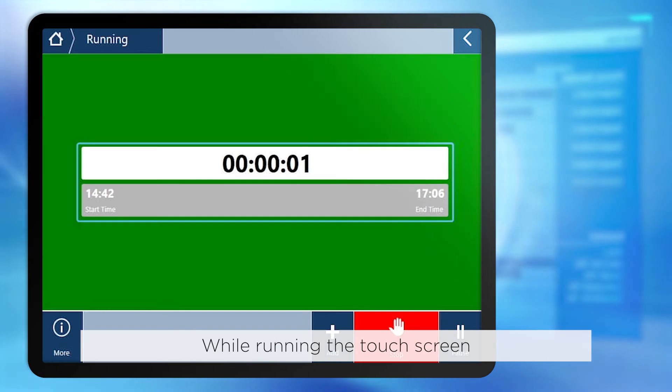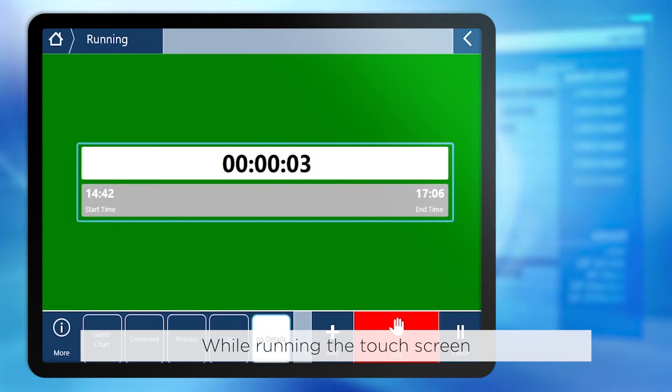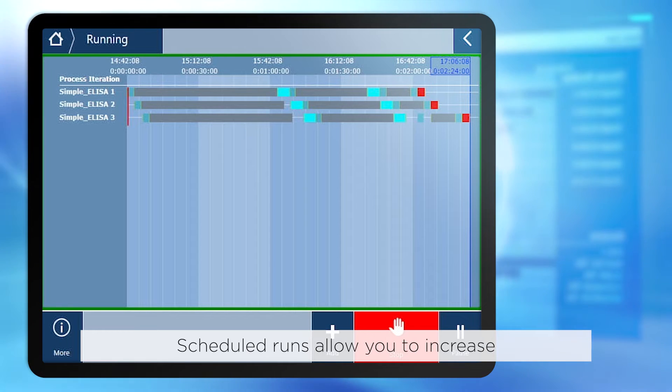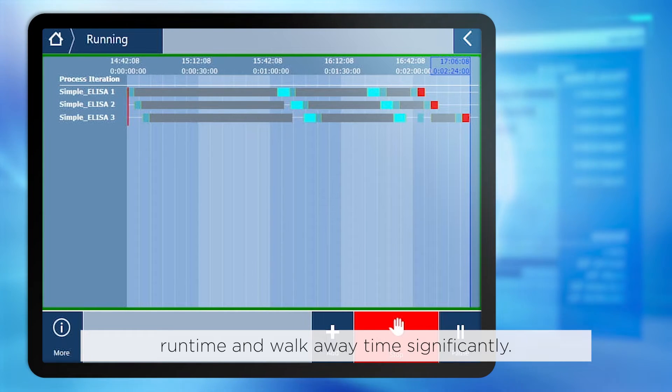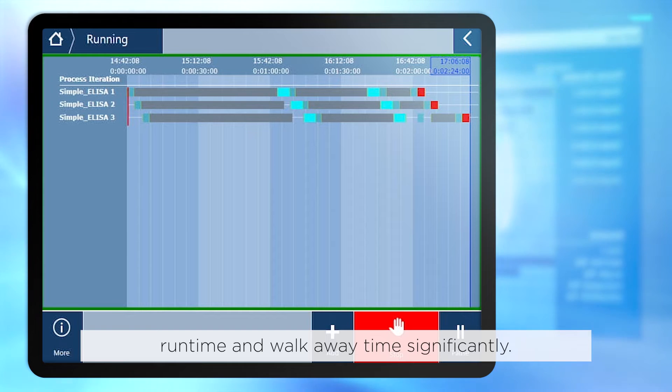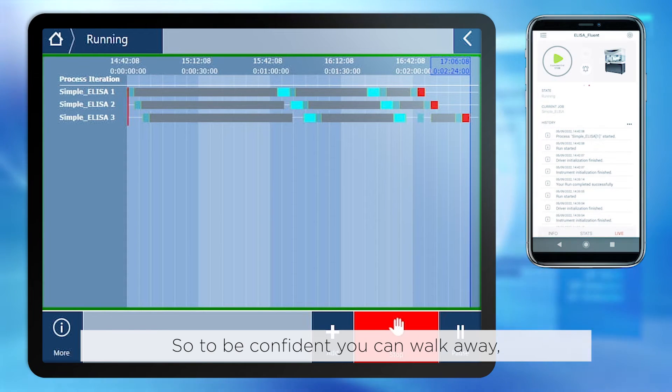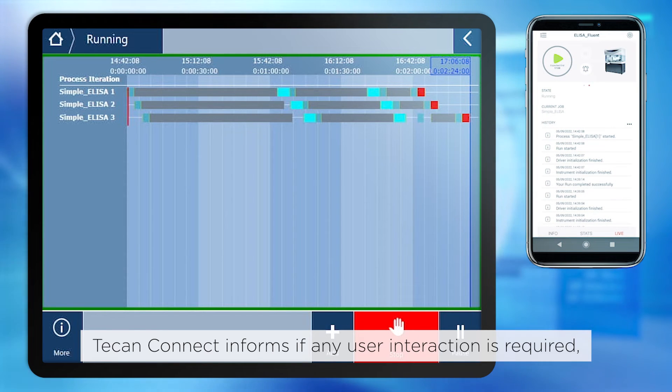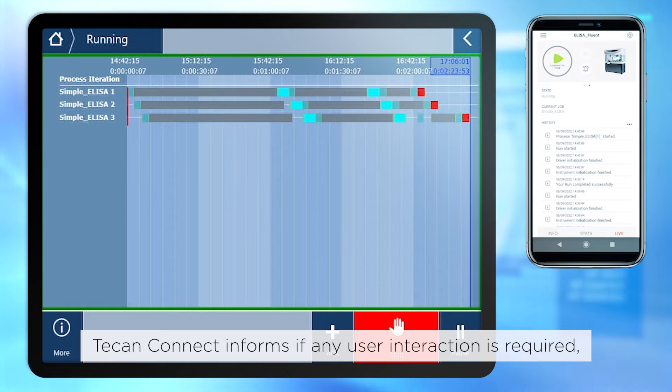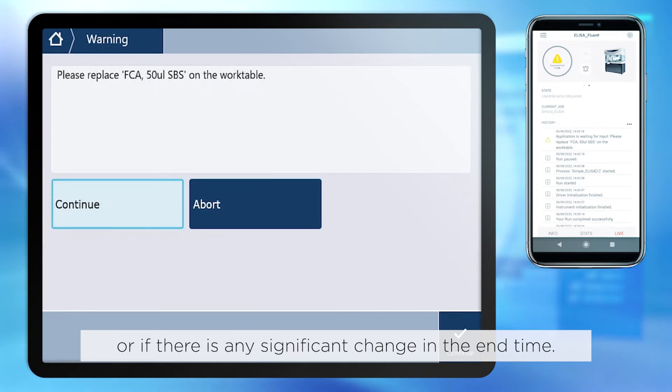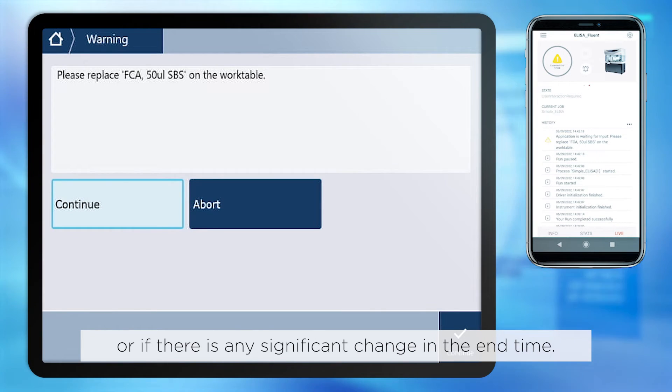While running, the touchscreen shows the progress in the Gantt chart. Scheduled runs allow you to increase runtime and walk away time significantly. So to be confident you can walk away, TCAN Connect informs if any user interaction is required or if there is any significant change in the end time.